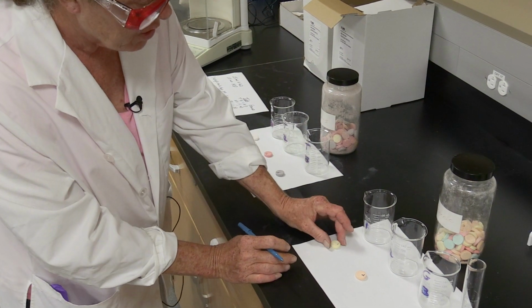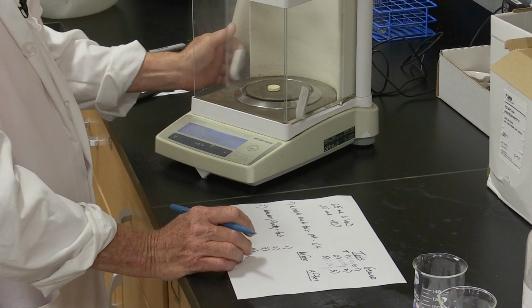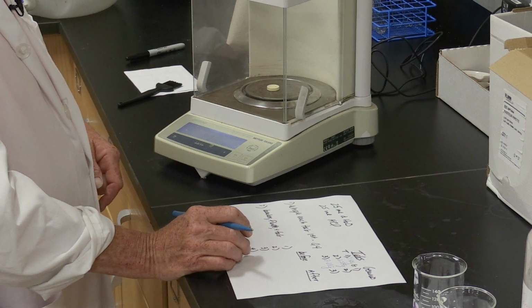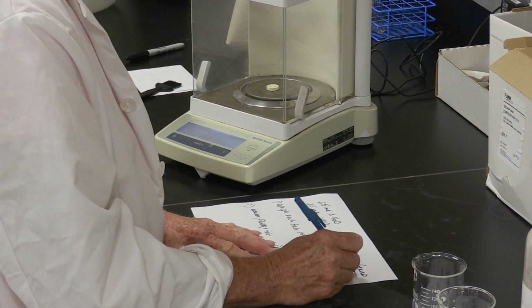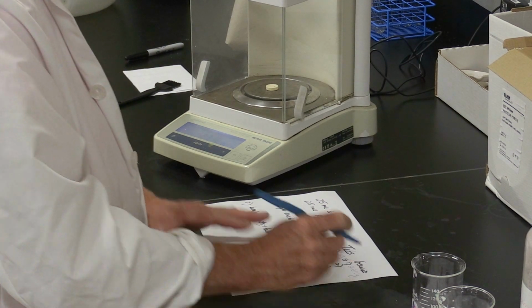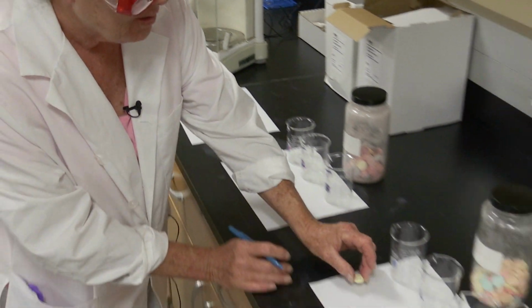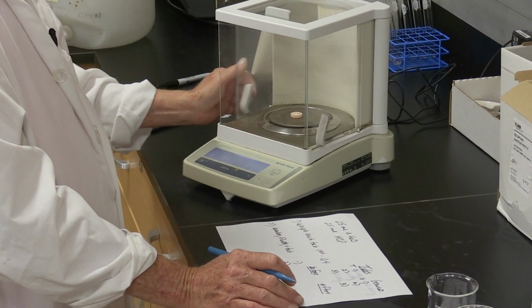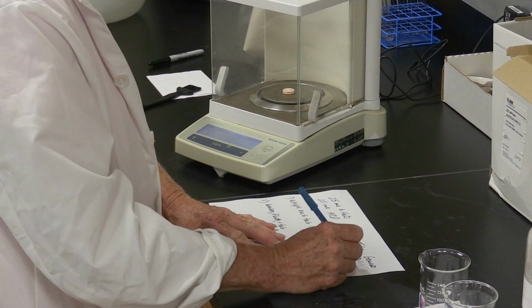Now we're going to weigh the generic tablets. So generic 1, 2.310 grams. Second generic, 2.303 grams.